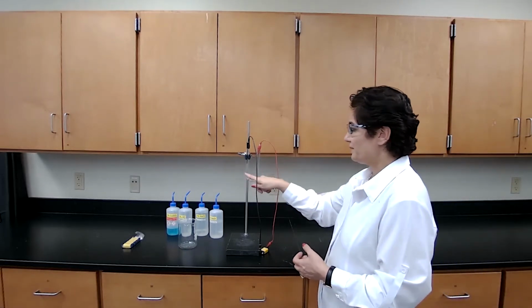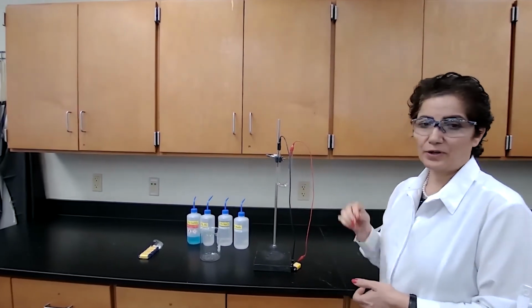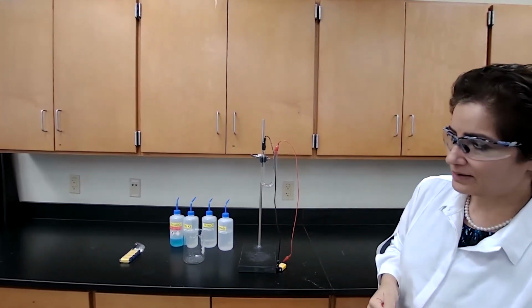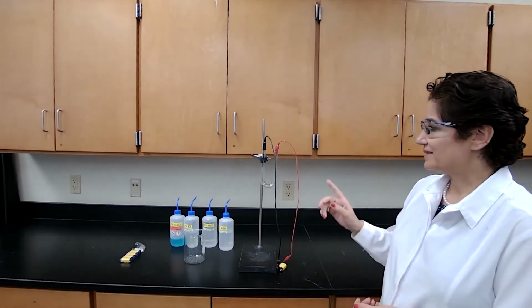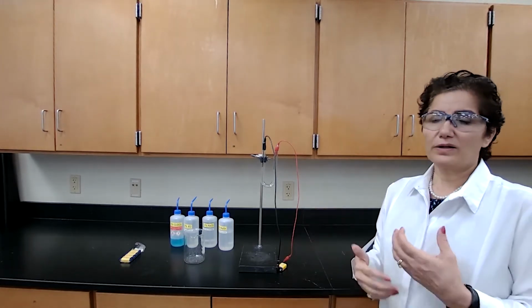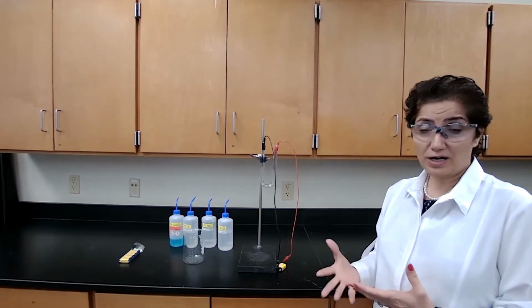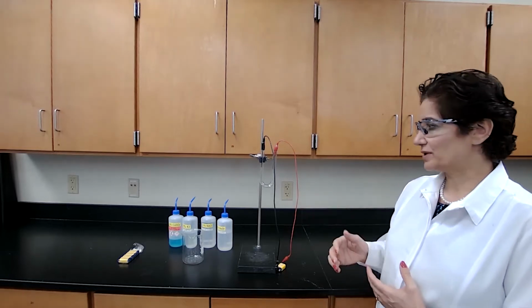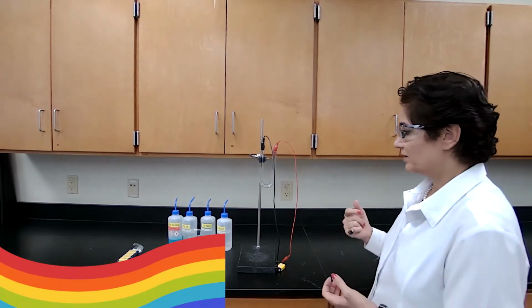After we fill up the tube with the liquid, I'm going to add phenolphthalein to the solution. The purpose of using phenolphthalein is that if water has been reduced, it's going to generate hydroxide ion, and it will show that reaction. It would be the evidence for reduction of the water.